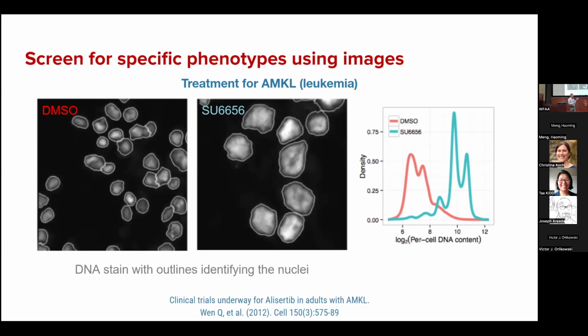The second interesting thing about this experiment is that visual variations in images tell us a lot about how cells are responding, but cell size is only one of the potential ways in which cells can respond to treatments. There are many other ways. So cell size is the easiest, and there are more complex reactions that cells can exhibit as part of any type of biological intervention.